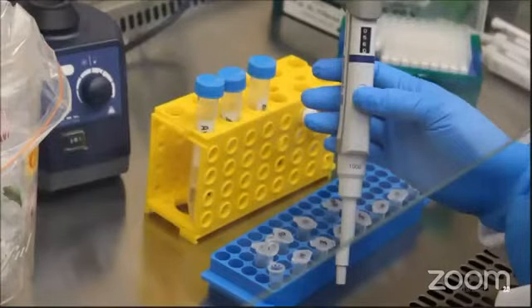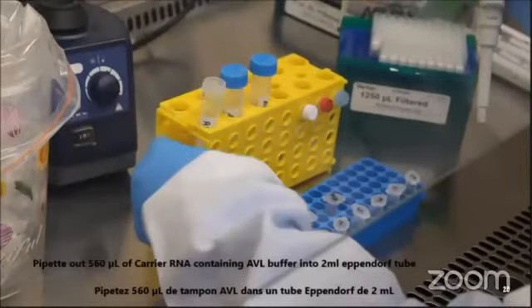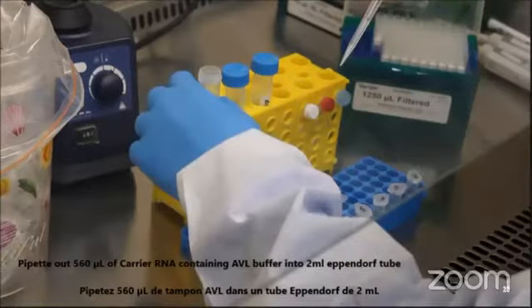Now, pipette out 560 microliter of carrier RNA containing AVL buffer into 2 ml Eppendorf tubes, which were already labeled with the identification number of the patient sample.